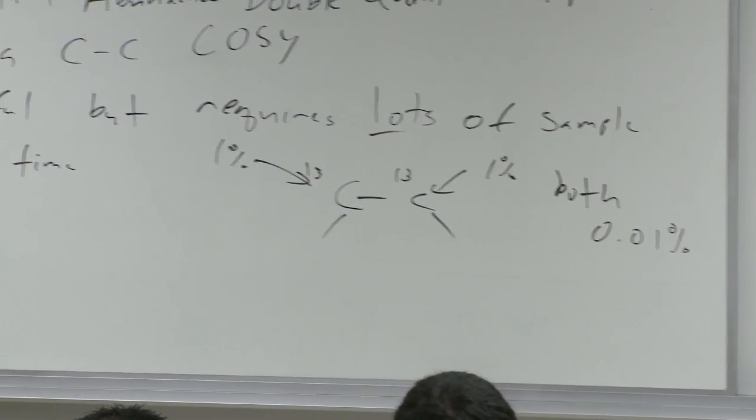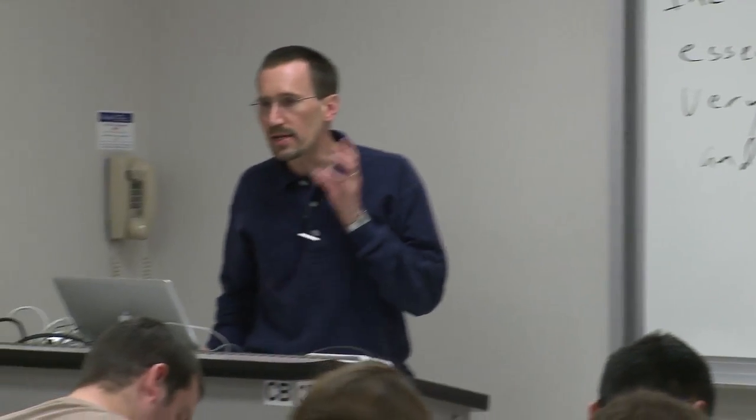And that really is the killer, because you've done carbon on strychnine. We loaded up the sample tube with something like 40 mgs of strychnine, and it's pretty quick.